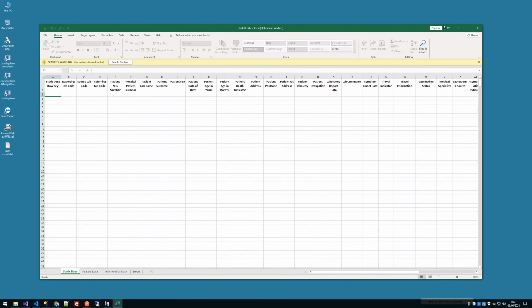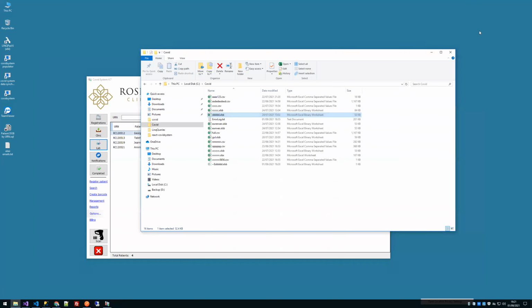They'll work out it's an amber country. I think it's not the system because things keep changing. And Public Health England are aware, but obviously clinics are not aware. So I think as long as they send it back saying, okay, here, they'll know. And if it's a red list country, they're not going to get any customers from that side anyway. So yeah, that side of things I think is managed by the PHE side of things. Okay.